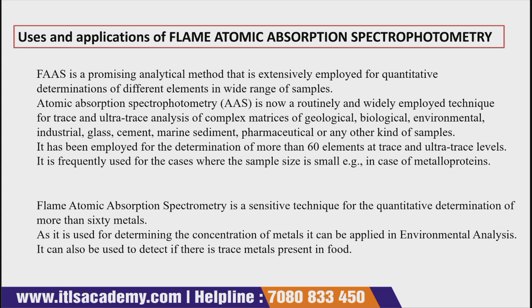In short, FAAS is a promising analytical technique that is extensively employed for the quantitative determination of different elements in a wide range of samples. Atomic absorption spectrophotometry is now a routinely and widely employed technique for trace and ultra-trace analysis of complex matrices.